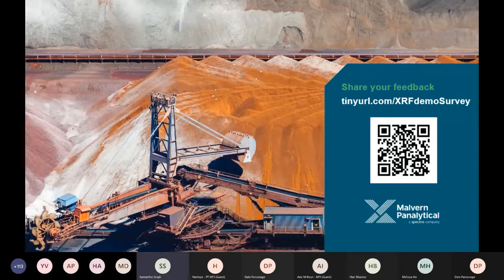Okay, great. We have another question. For limonite samples, how long do you recommend the sample analysis for Co, Si, magnesium result in for accurate and precise results?